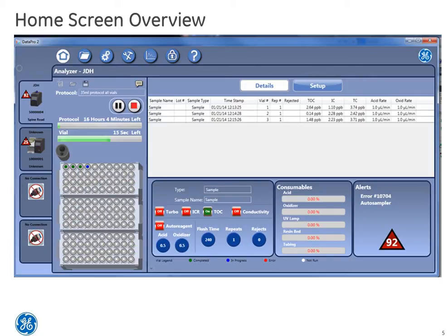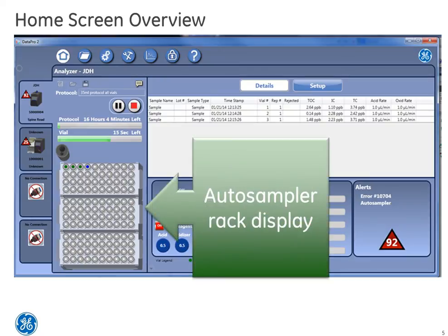Now let's take a look at the autosampler rack display. This is simply a graphic representing the connected autosampler, and we'll discuss the importance of this graphic in a different TOC talk.